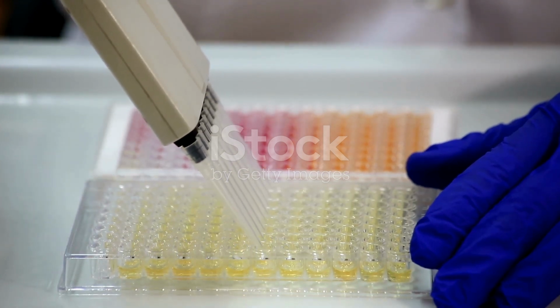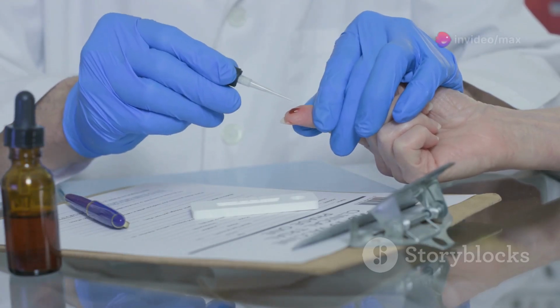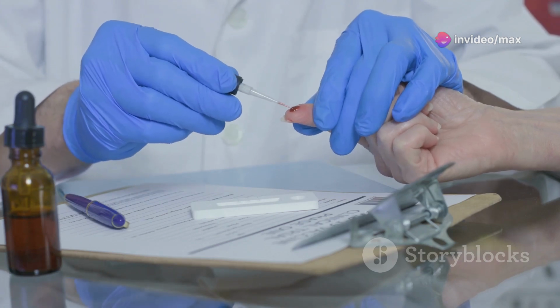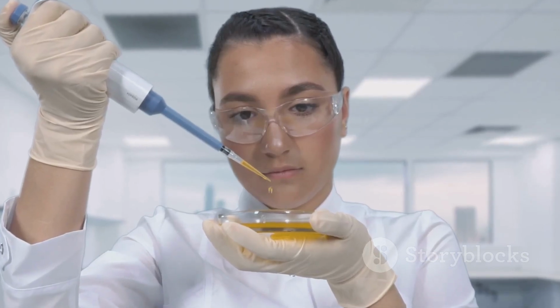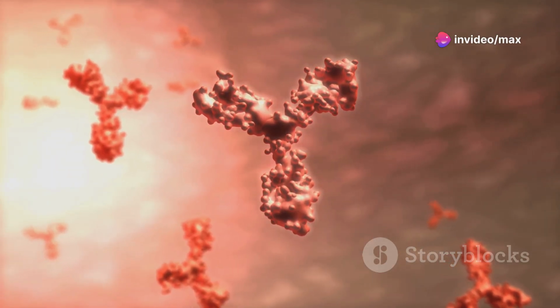The beauty of ELISA lies in its simplicity and specificity. It all starts with an antibody that specifically recognizes our target molecule. This antibody acts like a molecular homing beacon, seeking out and attaching itself to the target. But how do we see this interaction? This is where the enzyme-linked part of ELISA comes in. Attached to our antibody is an enzyme. This enzyme acts like a tiny signal flare.